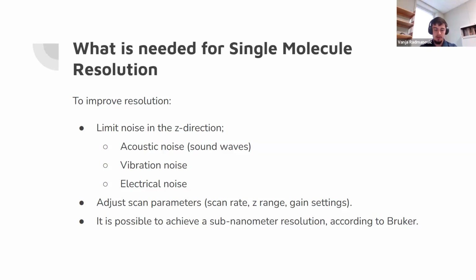So to limit electrical noise, an idea for that is to properly ground all the equipment and to use a common ground for everything to make sure there's no discrepancies, to limit electrical noise. And then also other ideas we have moving forward to improve resolution is to adjust scan parameters.